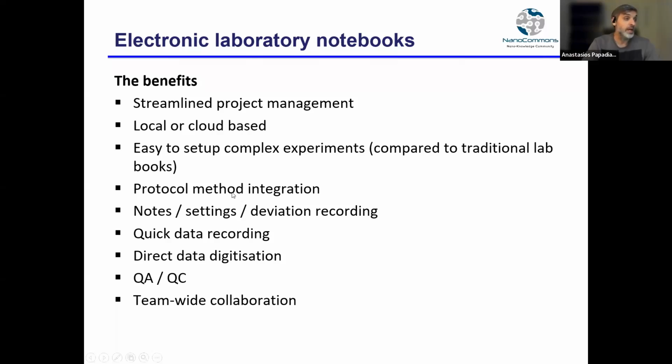And of course, it's the best way to go when you have a very complex experiment. Let's say if you do a mesocosm experiment that requires all the different scientific practices, to have everyone there in the process and recording everything without the need of very long and complex mail exchange or chat exchange.